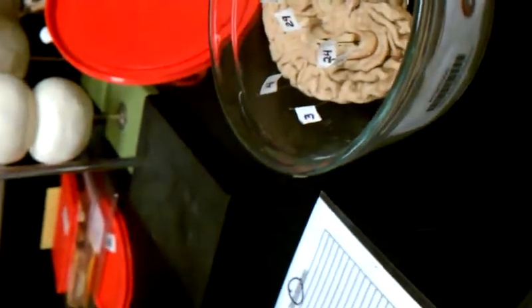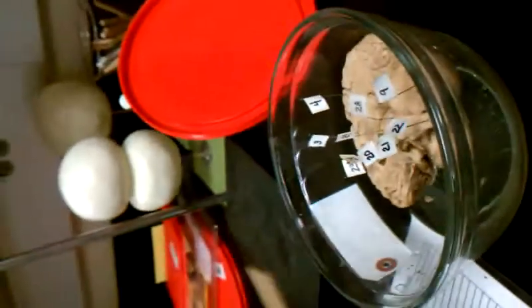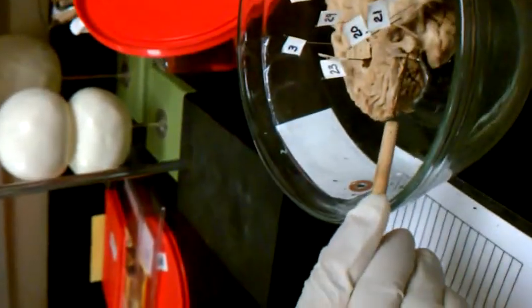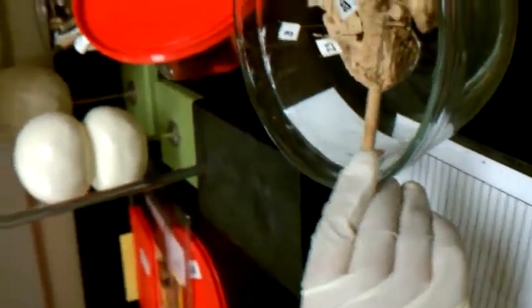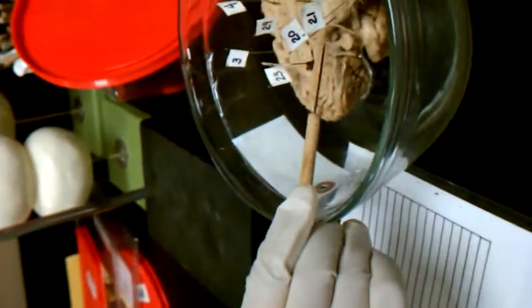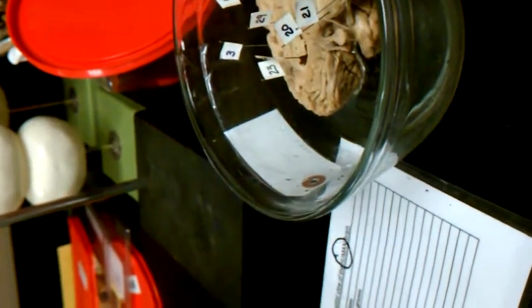Okay. Let's go over here. Look at the human brain. Everything is the same, only the shape and size are different for the most part. So you see all the structures, between this and that. And in this, you can even see the pituitary gland attached. Oh, okay. The hypothalamus with the infundibulum. It's a hollow tube, so when it breaks off, you see the hole.